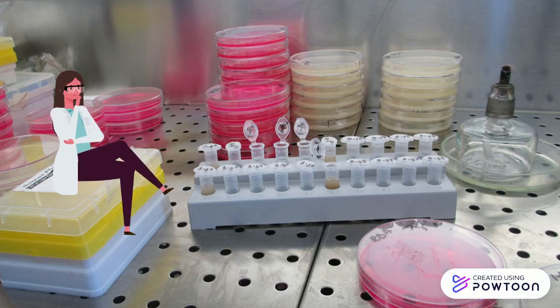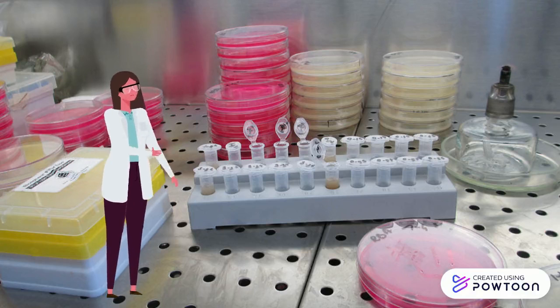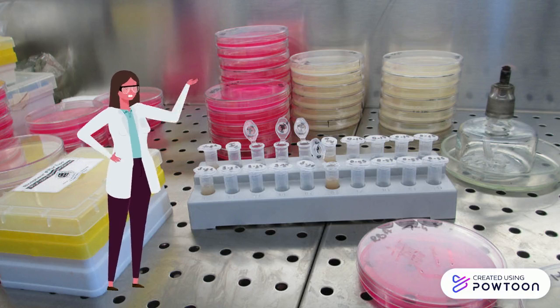So you have just designed and completed a beautiful experiment. Congratulations! But now you need to visualize and quantify your results. One of the most important techniques in the lab to do this is through gel electrophoresis.